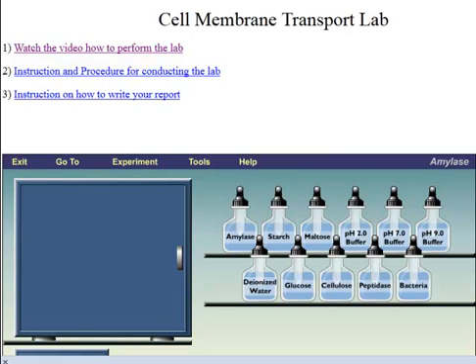A few students emailed me concerned that they couldn't do the lab and had trouble conducting it, so I'm going to show you step-by-step what to do.